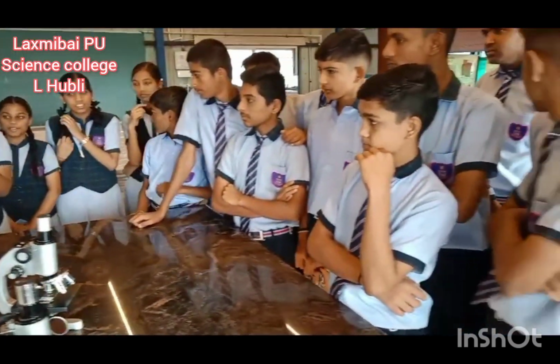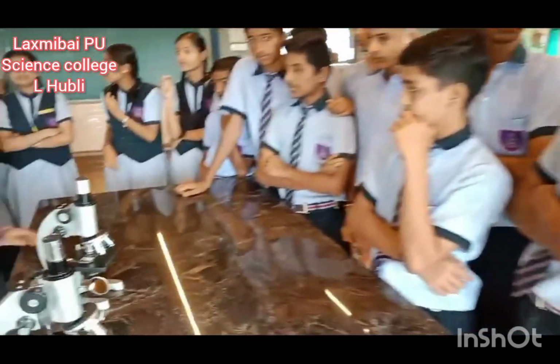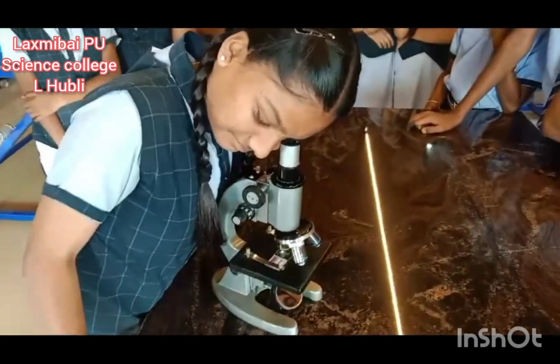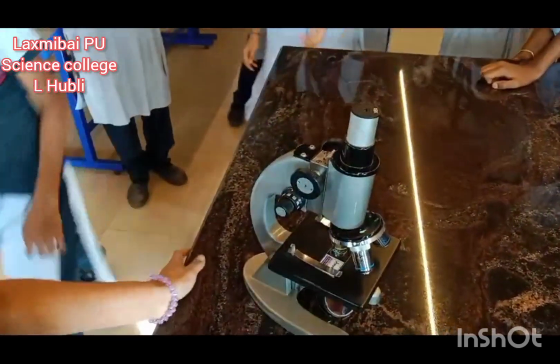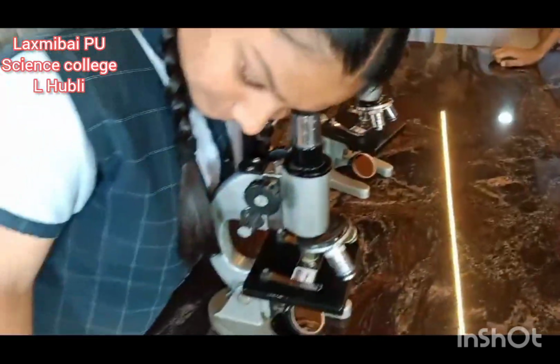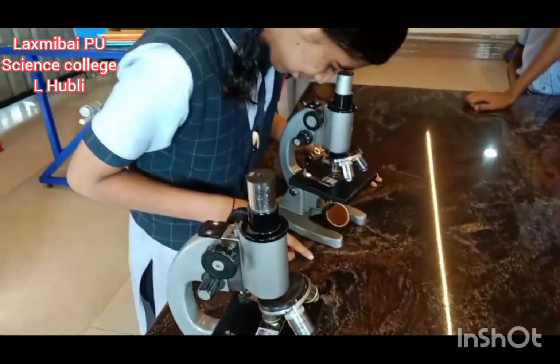Next. Who has not observed? Come front. Observe. You need to close your right eye so that you can observe it clearly.